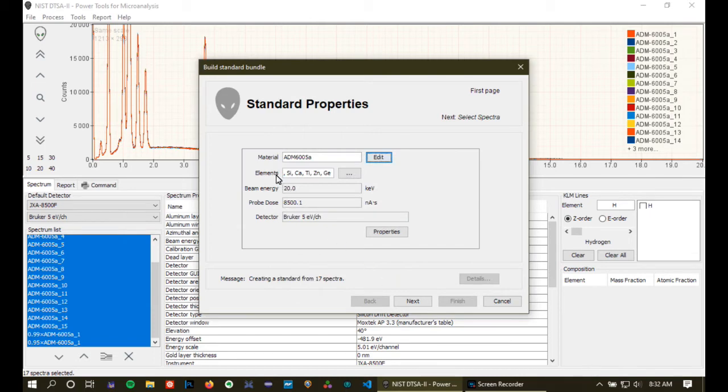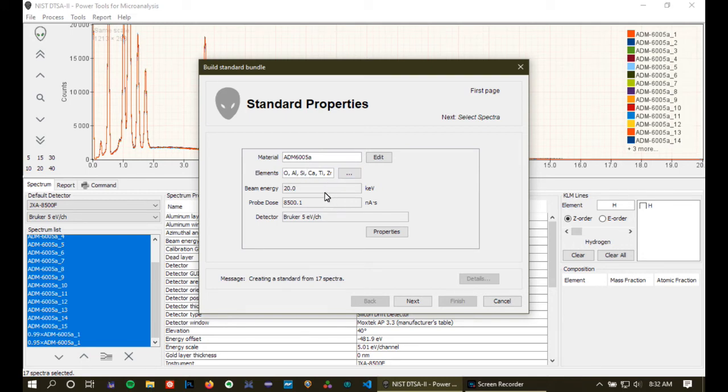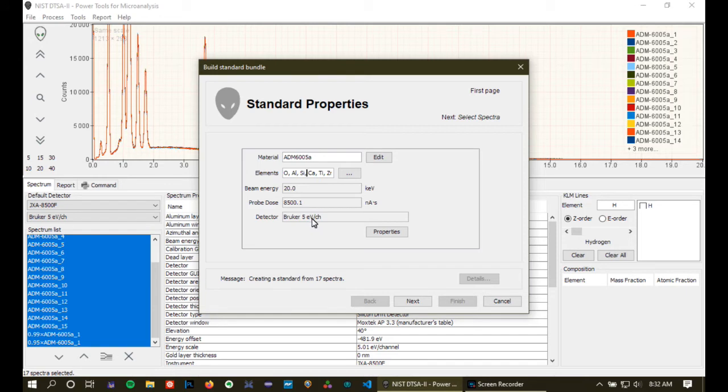Well, I've entered that material into the database previously and so I can just put the name that it's known in the database here and it will read that information in from the database like this. So that's good. Okay, the standard contains these elements. If we wanted to use it only for a subset of these elements, we could remove some of these, but I really want to use it for all of the elements that are present in the material.